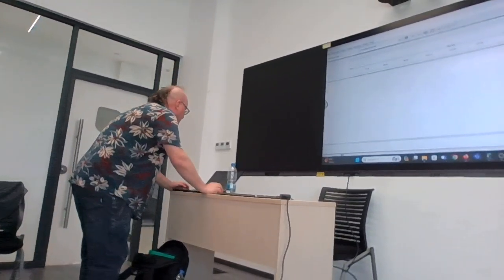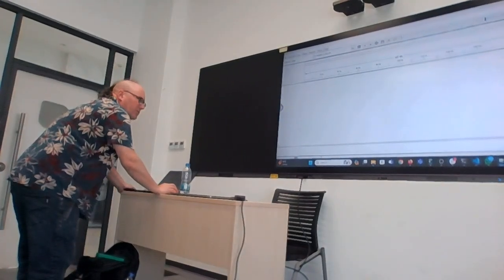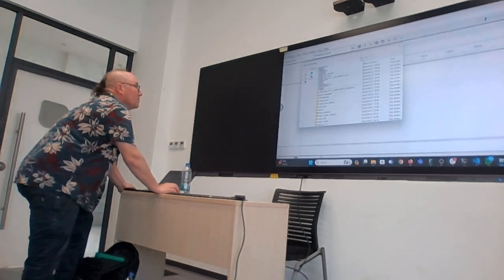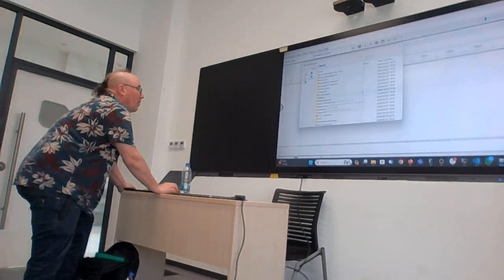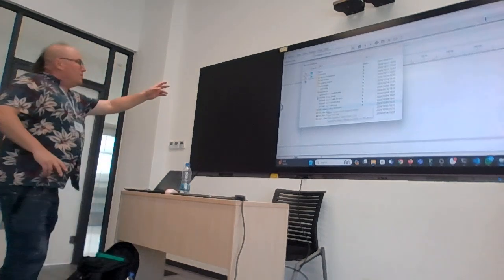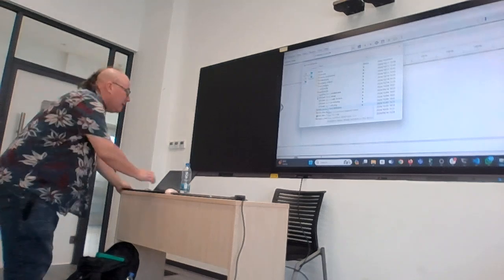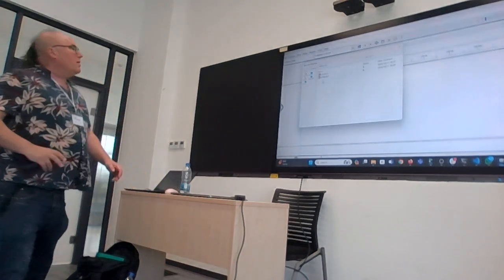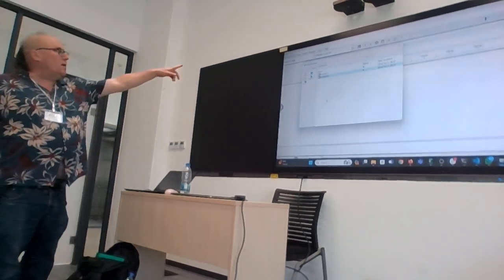I think I put reference genomes on the flash drive. Did I? Yes, you called it references. I put references. So here's the data that you got on the flash drive, and the references. Kirsty, can you make a note that we need MT903?